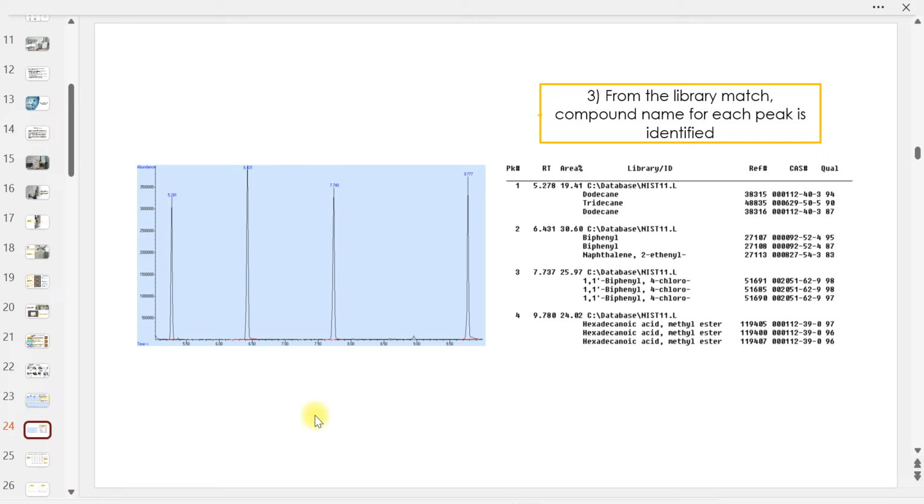The problem is memang tak ada orang yang beli yang latest. Even in hype pun kita masih lagi pakai 2011. Saya tak sure. Yang macam in hype, GC dia pun dah rosak. Dah gila dia tak nak beli kan.